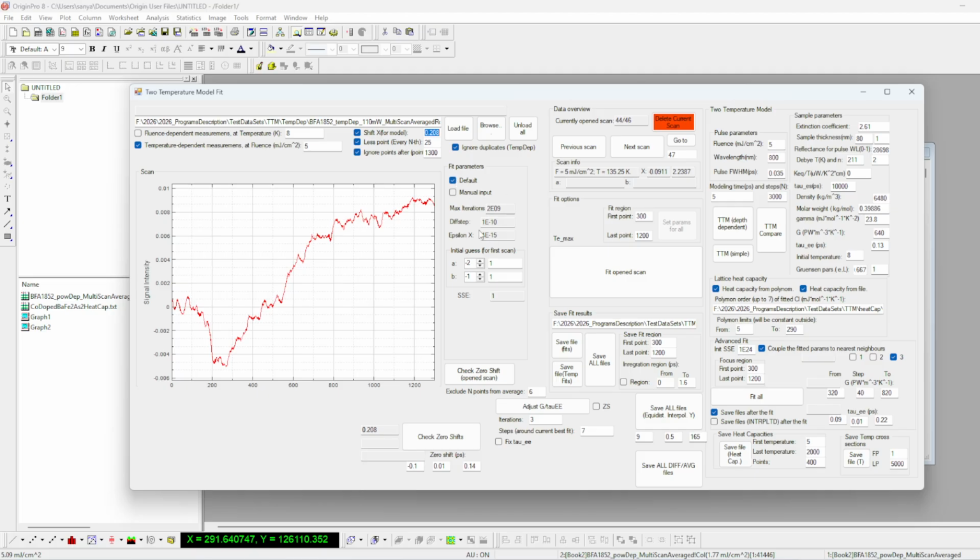This is for the old version of fits. Right now, these parameters are still used, but the main parameters for the Adam optimizer for the gradient descent fit are already inside. These parameters have very little effect. You don't have to change them.